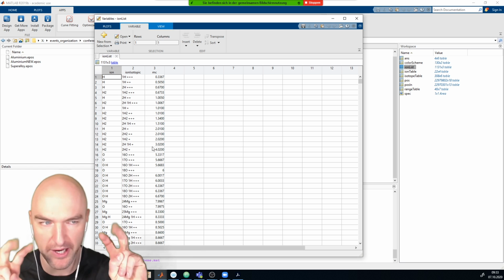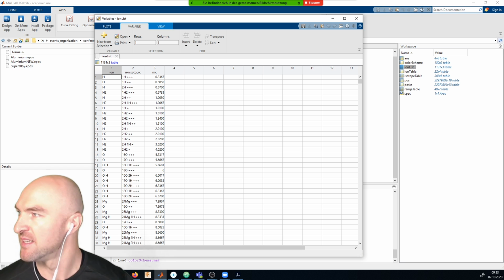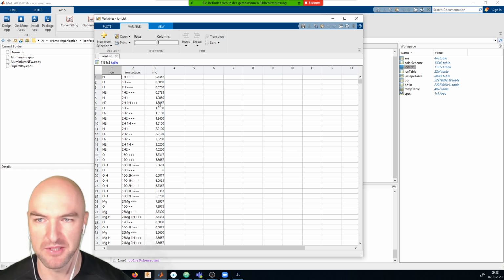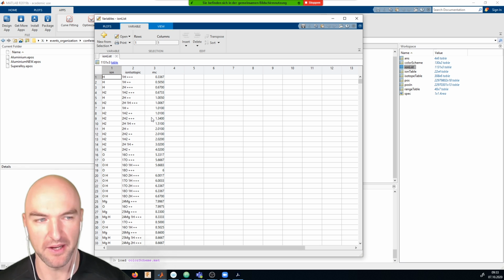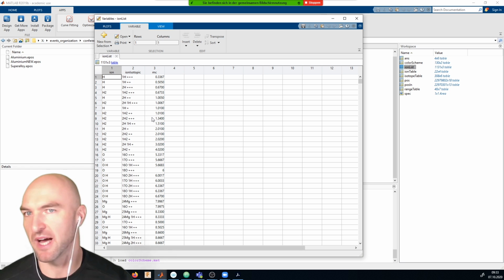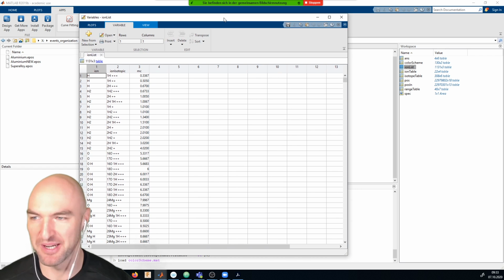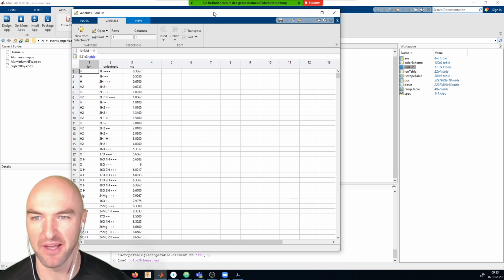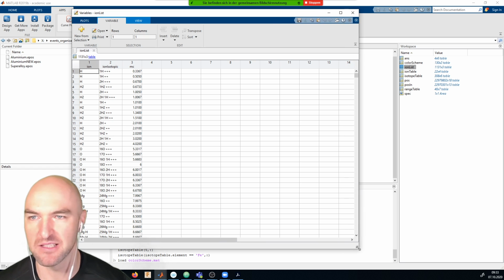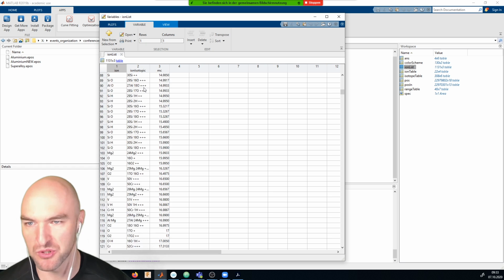But we also have an ion list that is curated, which means that one of my student assistants, Teresa Fuchs, has gone through a large part of the Atom Probe literature already and just looked up and collected which ions people have seen in their data sets. And so you can go and also search based on that.